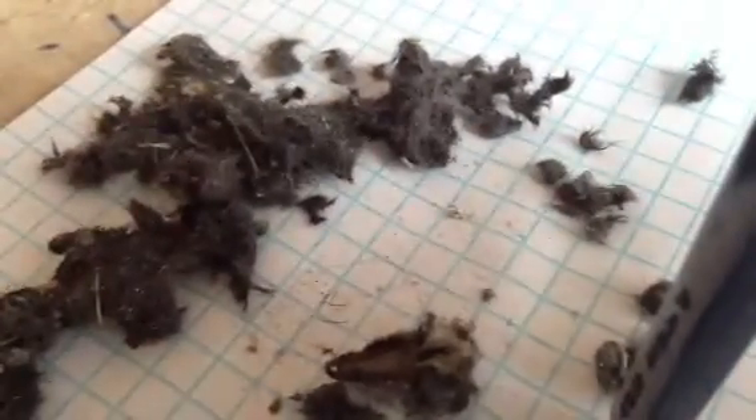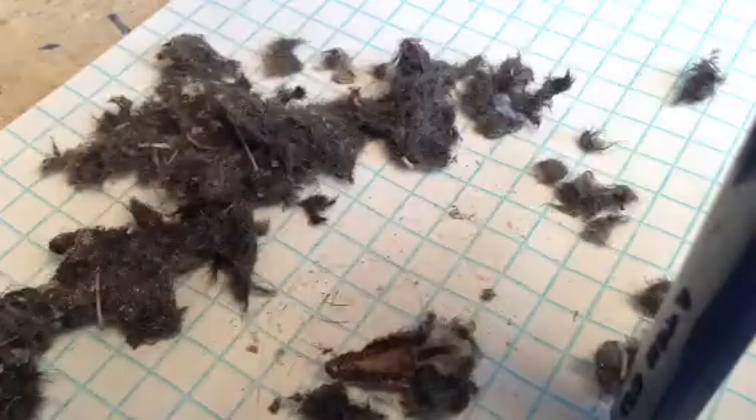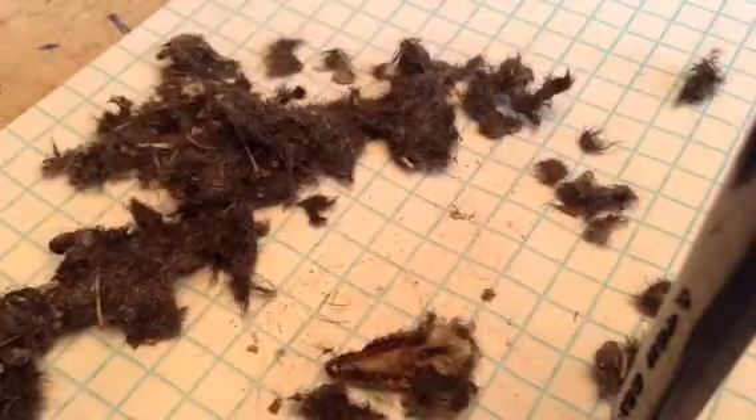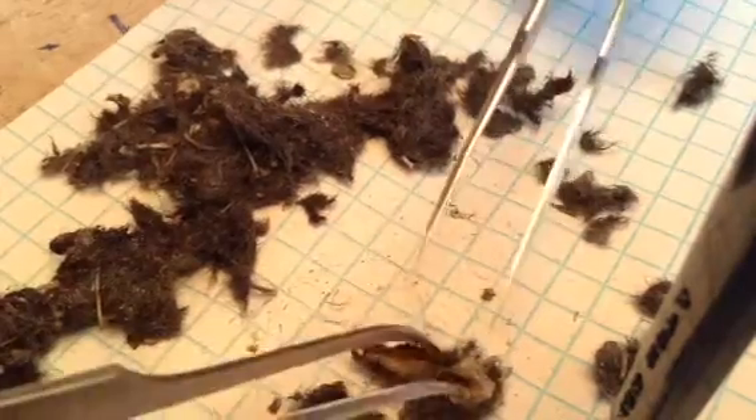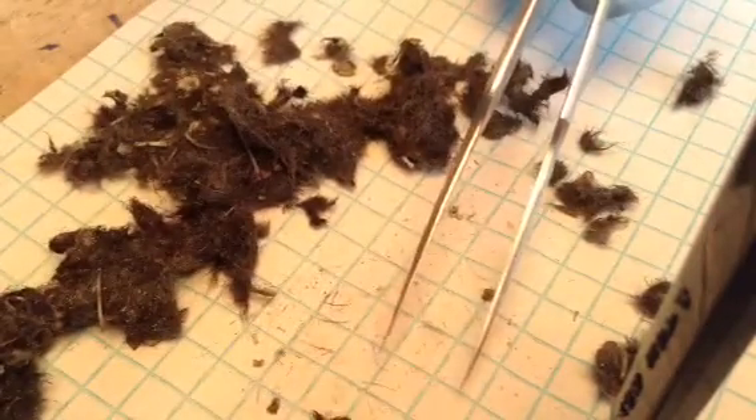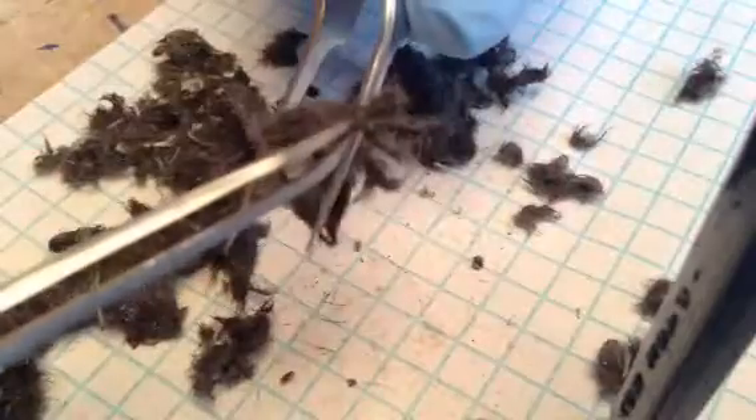Turn the light back on. I'm going to continue to pick. I'm going to partly finish this pellet and then shut the video off and make another video because my time is running out.